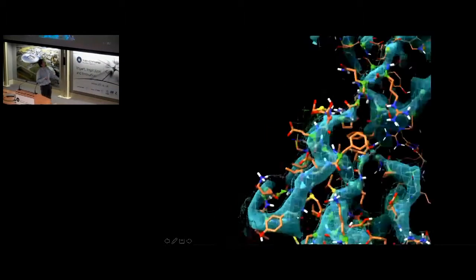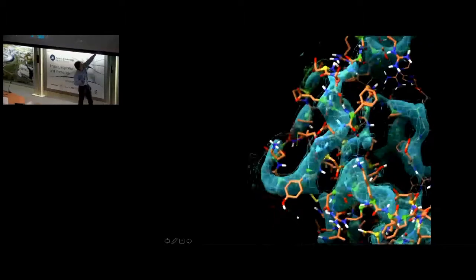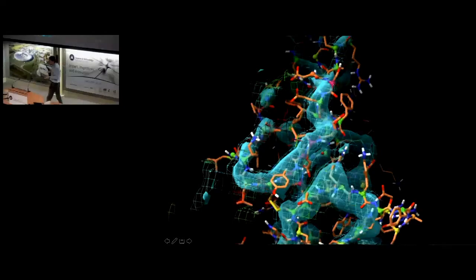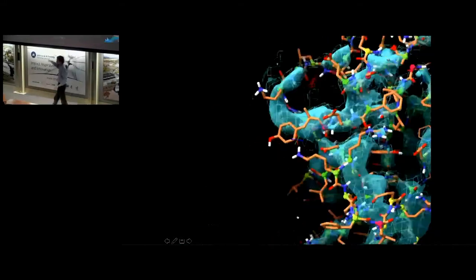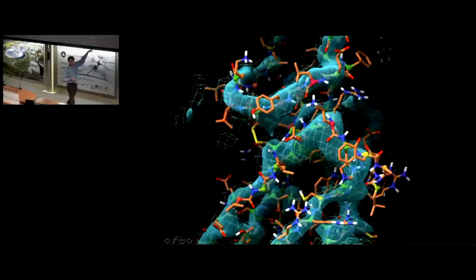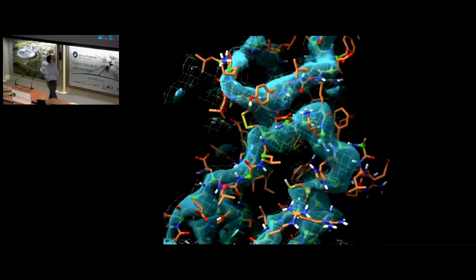It goes on for another minute or two, but it's essentially the same job. We grab that tail end, pull it up into there. This guy needs to move in register here, and again, it is actually fairly easy to add scripted forces to help you move, for example, a beta sheet in register. You just set position targets for the atoms in the new positions where they need to be and have it move for you, and then you just tinker around the edges to actually help it fix itself.